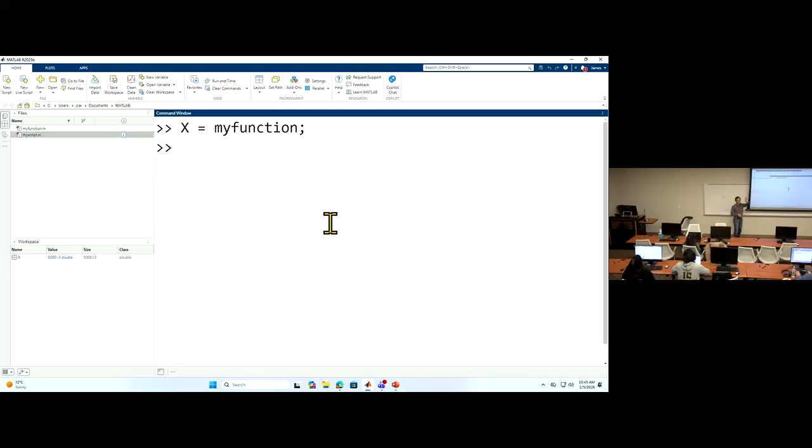This function is very simple. It requires nothing, but it generates a matrix with 5,000 cells, 3 genes. You will see that the internal intermediate small variables x, y, z are not given in the workspace.